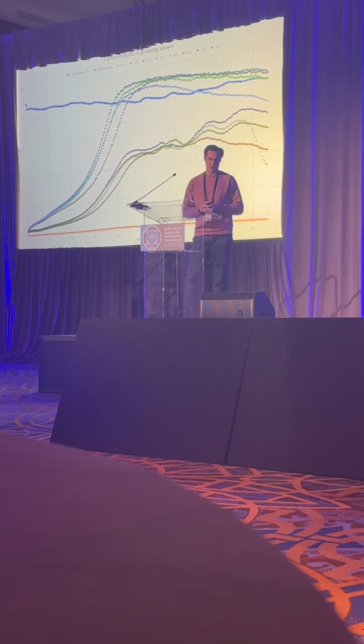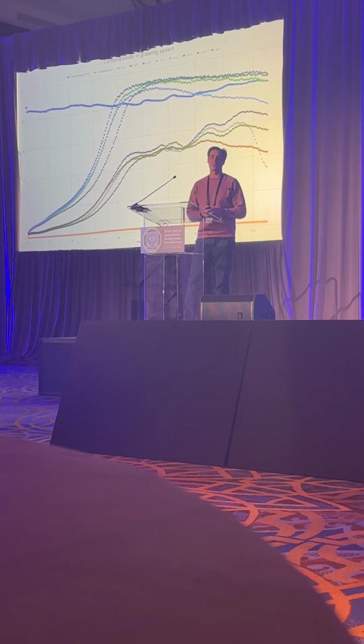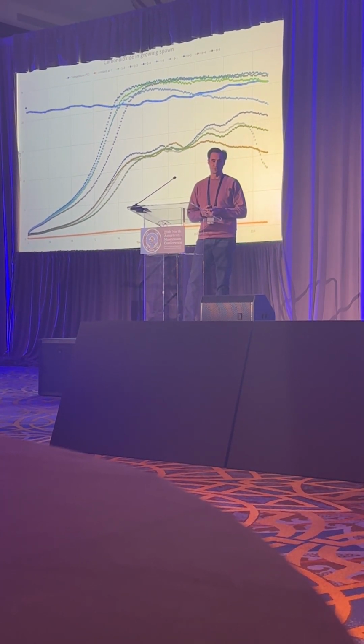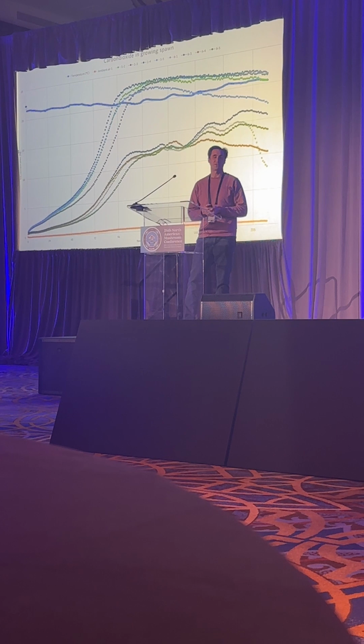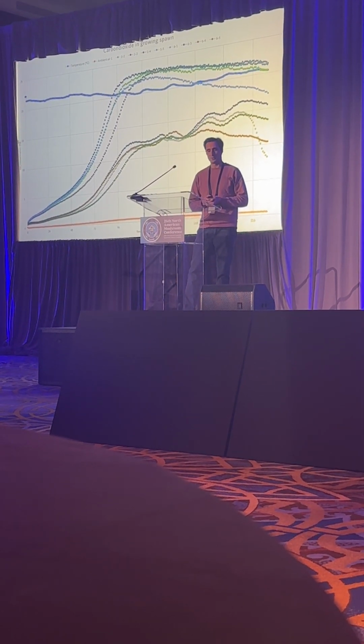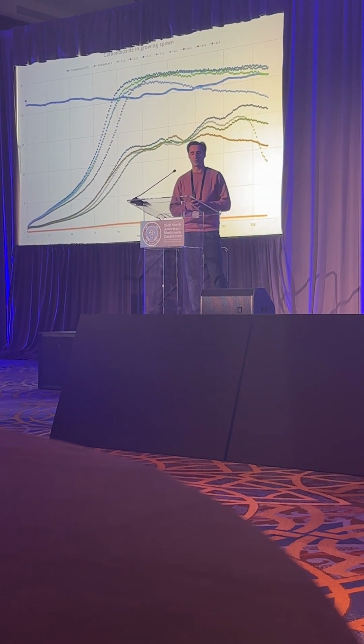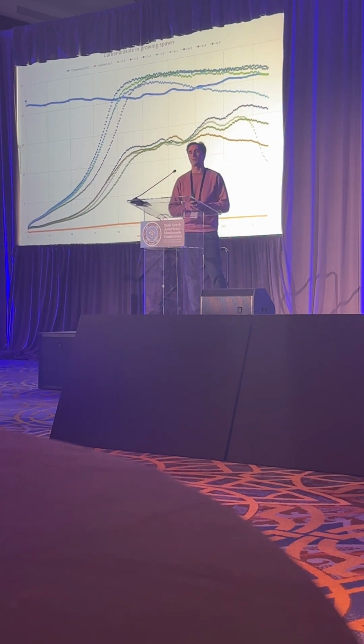Okay, from 24 hours to 48 hours, we see a steady increase in carbon dioxide. We call this the leap-off phase, first visible growth. So carbon dioxide concentrations increase, and then at 48 hours, we start to see exponential growth, an exponential increase in carbon dioxide. You see that these curves go up really quickly, right up until about the 100-hour mark, about 4 days after inoculation. And then at 100 hours, we have a tipping point.